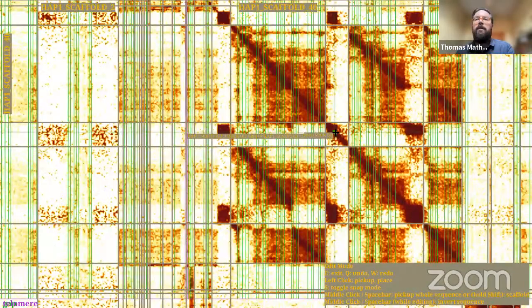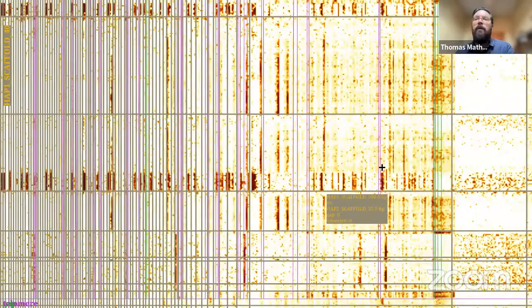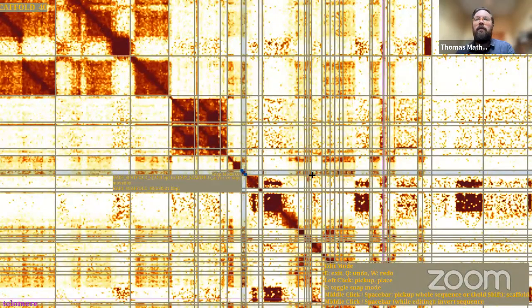We'll not go there. So, see what we can see. So here we're looking for extra unplaced content that may belong with one of these chromosomes. I can't see anything immediately obvious there. Let's turn the gaps off. Something else. Okay. So, piece goes there.